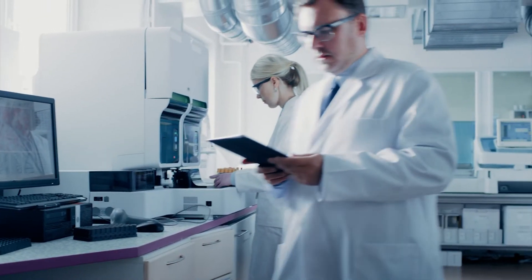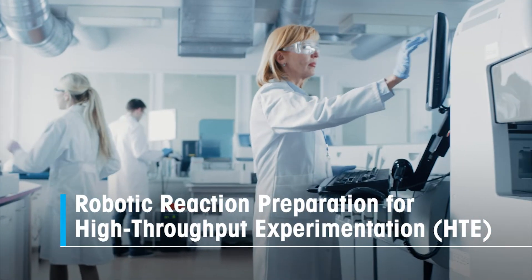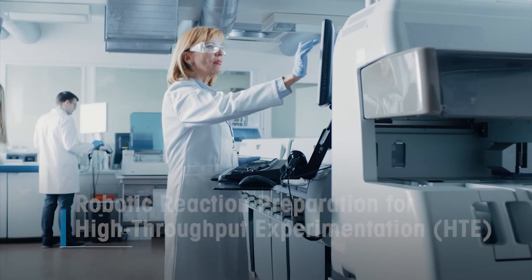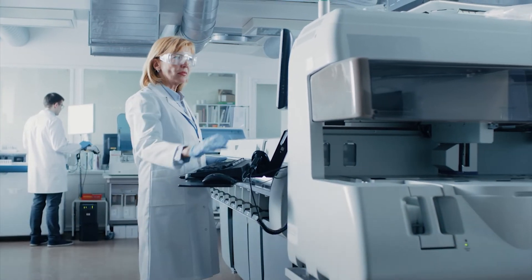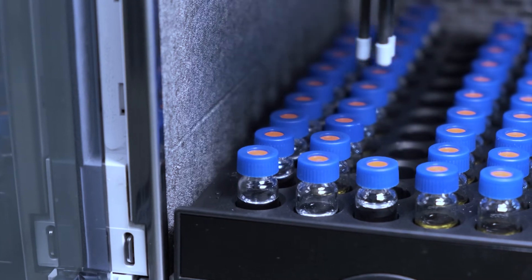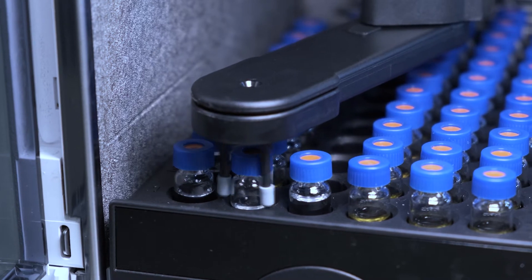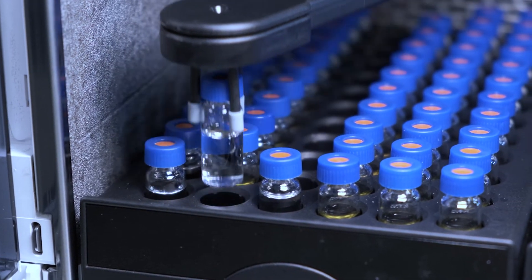High throughput experimentation, or HTE, is a powerful methodology in the pharmaceutical and chemical industries for optimizing reactions and testing compounds. Using HTE, several reactions are performed in parallel with slightly different parameters to find the ideal reaction conditions.